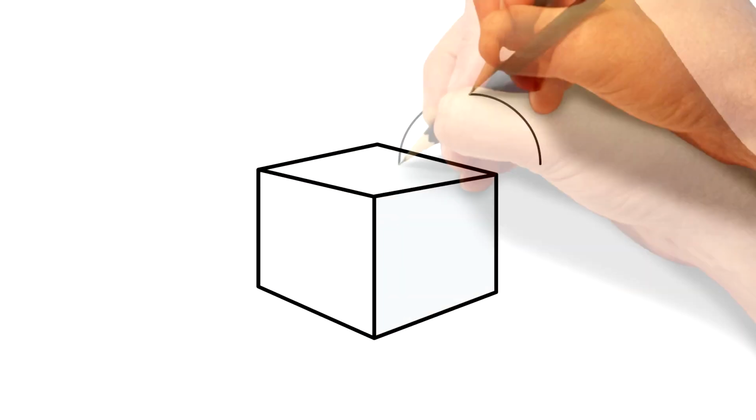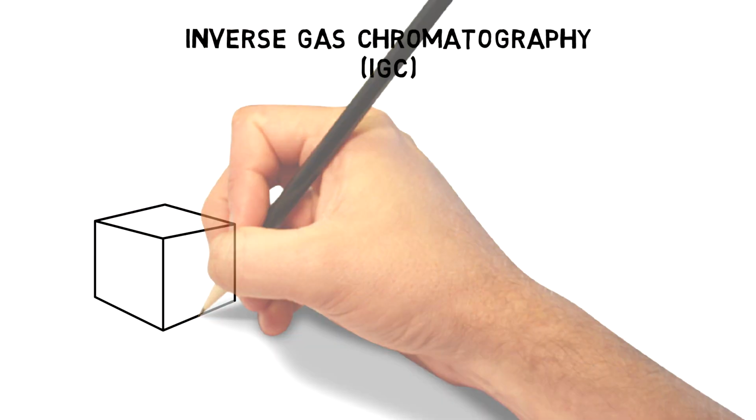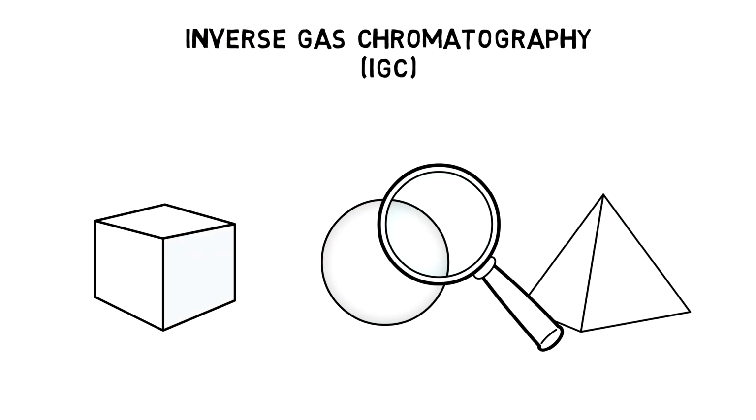Do you struggle to characterize the surface properties of your product? Today, you will learn about inverse gas chromatography, which is a specialized method to characterize surface interfaces.